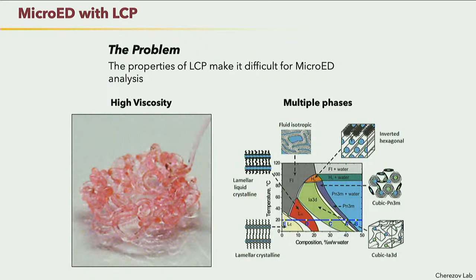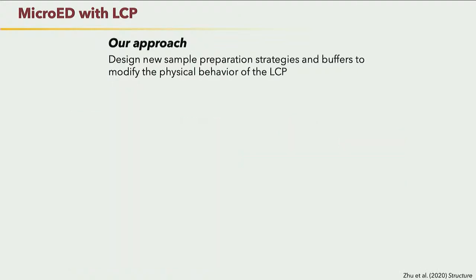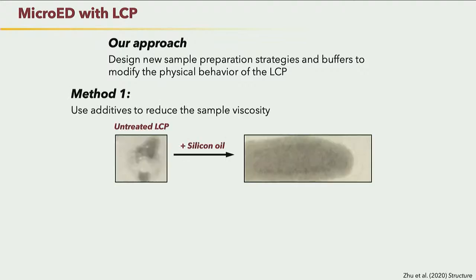So this was done in collaboration with Wei Lu, who is a colleague of ours who's sort of an expert in LCP. So we said, okay, let's join forces. Let's figure out how we can manipulate the LCP so we can make it usable for MicroED. So our approach was to figure out how to get the crystals from the LCP onto the grid, so we can see through it and collect diffraction data from the crystals in the LCP.